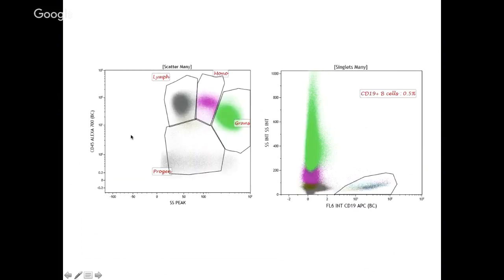So here you see, there are very few CD19 positive B cells, very, very few, only 0.5%. Now we have to focus on these cells, 0.5% cells in the bone marrow. So we take a million cells, means 10 lakh events, and study if you have any abnormal cells. And any number more than 0.01% is significant. In B cell ALLs, 0.01% or more MRD is clinically significant.